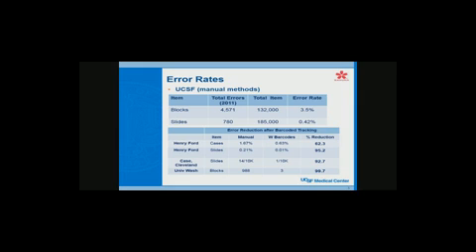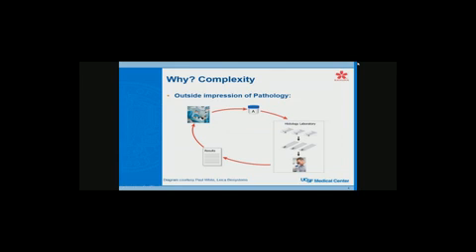There are several studies, papers in the bottom box, that show different institutions that implemented barcoding and what reduction in errors they saw. Henry Ford saw anything from 60 to 95% reduction in errors between cases. Western and Cleveland saw a 92% reduction in error rate on their slide misidentification. University of Washington on their block identification saw a 99% reduction in error rate. So this is the sort of thing we're looking at when you go to a system that is largely automated, where the pass-offs between groups, say grossing to histology, are automated rather than manual.